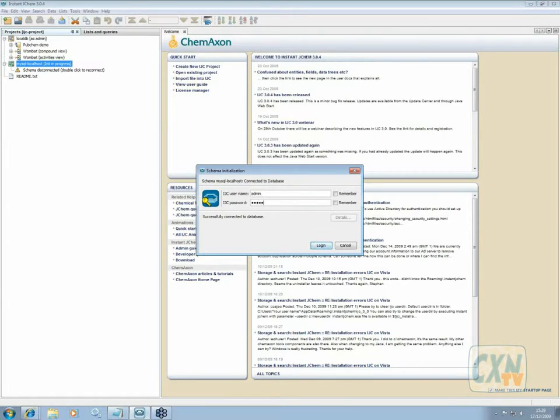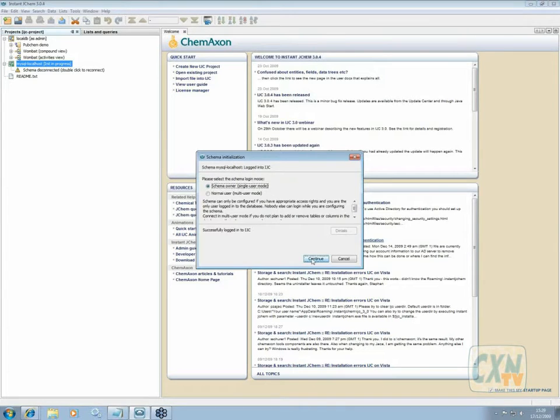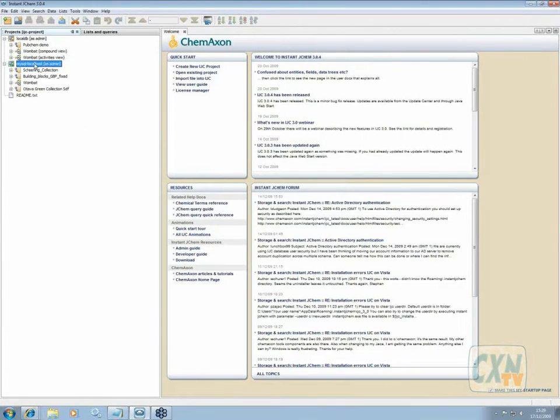So I type in the username and password, and this is the magical admin username and password that I just pointed you to in the XML file. That is there so that you can actually log back in. Because if you change the security and don't give yourself any users you can log in with, you're a bit stuck. So we provide this magical admin user that, once you've got your other users set up in the database, you can remove.